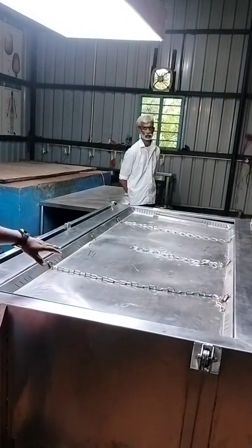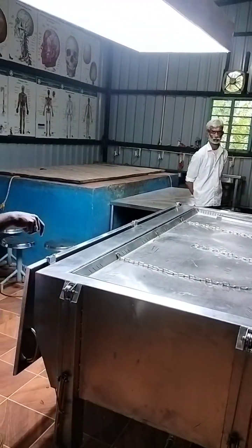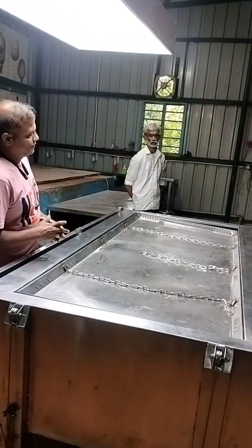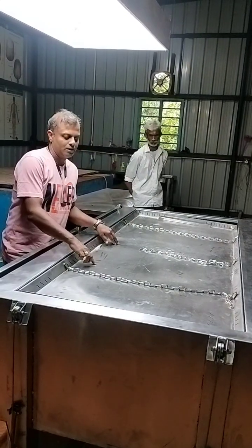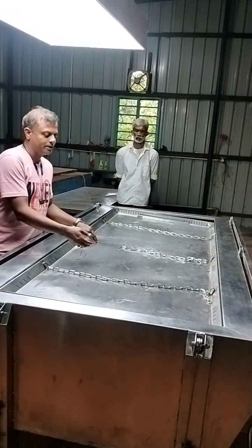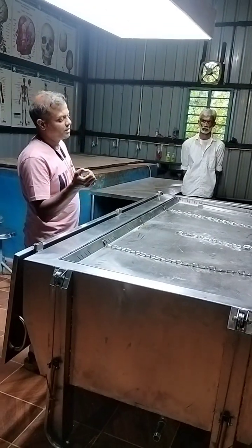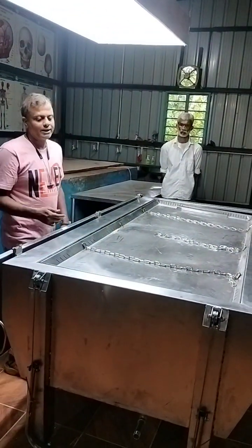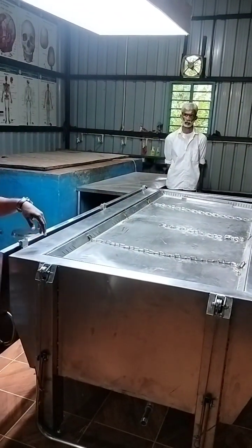When you have dissected the body, there might be chances of small particles or organs left after the dissection. Heavy parts you can take out here, and any small tissues that can drain through the tiny drain holes can be taken out easily by removing this tray from the cabinet. That is also very easy.